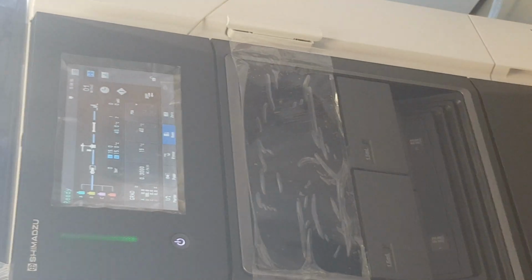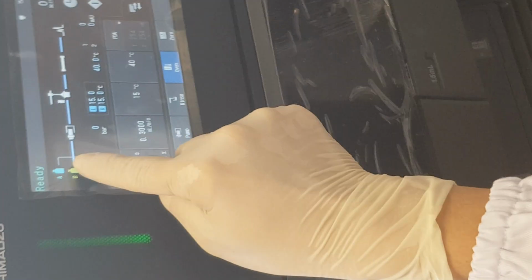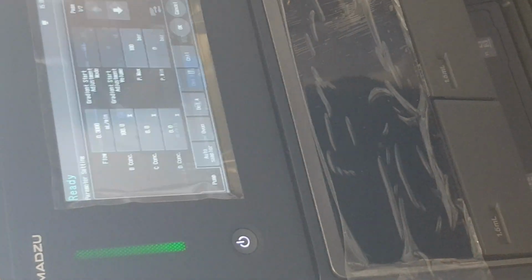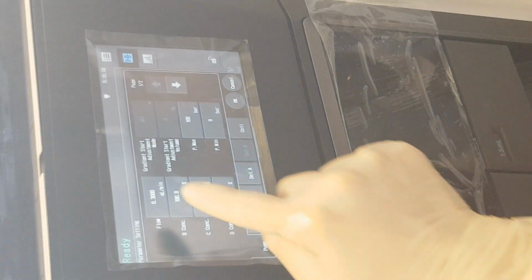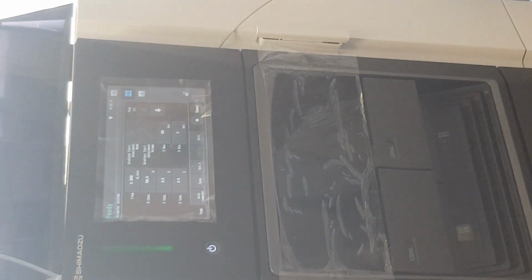After purging is done, you will need to go to gradient and then touch the 4 colored bottle. Then you will set the percentage of mobile phase required for that day of your experiment. In this case, you have to look at your protocol on the worksheet and look at the setting.